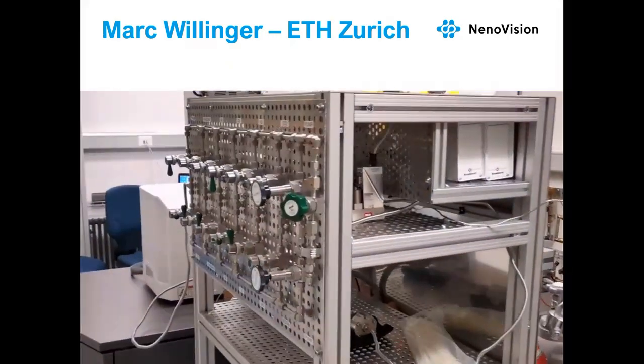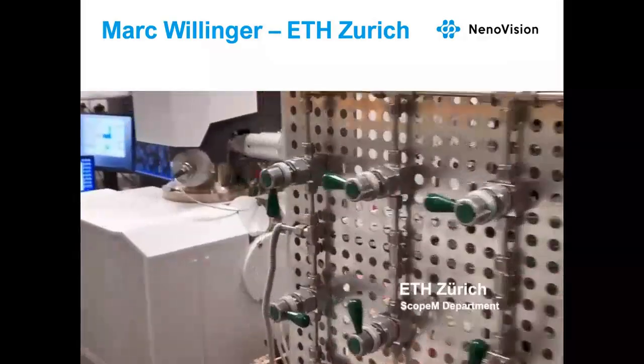We are here at the Scientific Center for Optical and Electron Microscopy of the ETH Zurich. My name is Marc and my business is in-situ electron microscopy. We have recently acquired here at ETH NenoVision AFM. This AFM is running inside the chamber of one of our SEMs, and it enables us to do correlative studies of our materials. We can combine whatever we see in the SEM with whatever the AFM delivers.